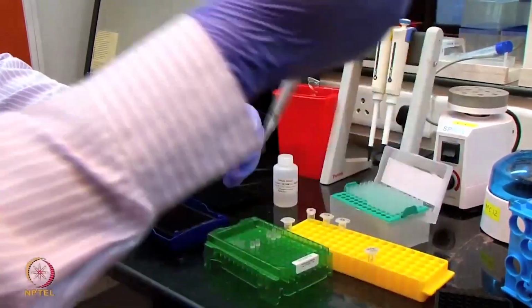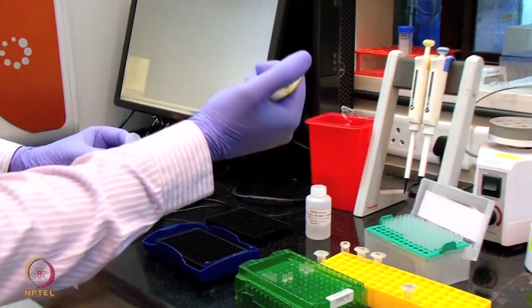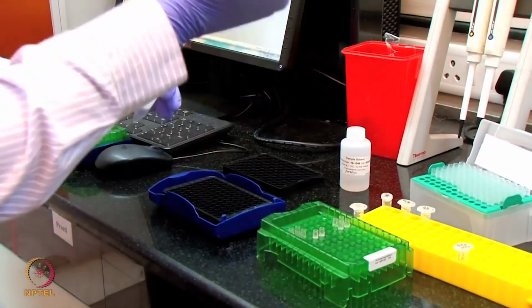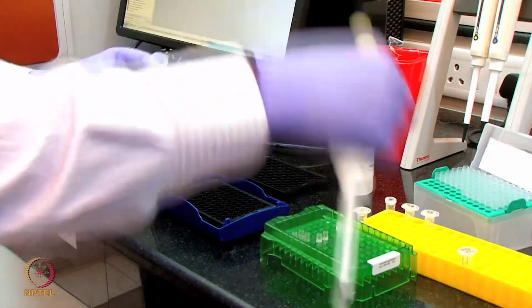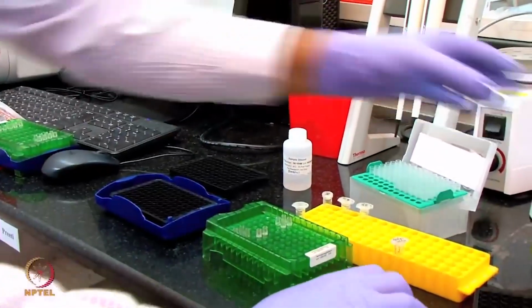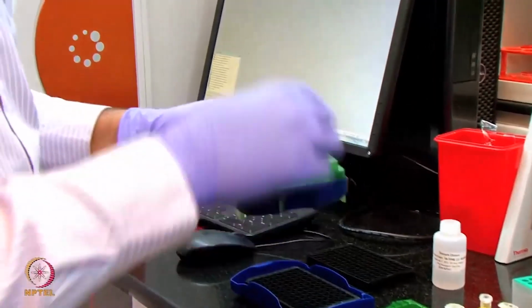What I am doing is adding 200 microliter of 1x PBS into the 96 well plate. Next, I am taking the biosensors, which are the streptavidin sensors.